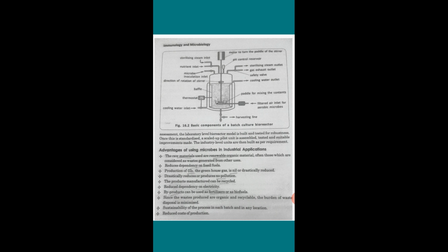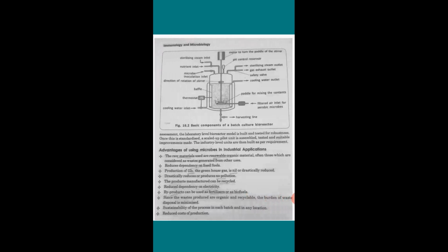We can see the components of the bioreactor in detail. Here you can see motorized stirrers. Motorized stirrers are used for the mixing up of the microorganisms with the nutrients. For continuous and consistent mixing, this motorized stirrer with the paddles below is utilized, for achieving a constant motion, and it will ensure the agitation between the nutrients and the microorganisms. Then another part is the baffles.